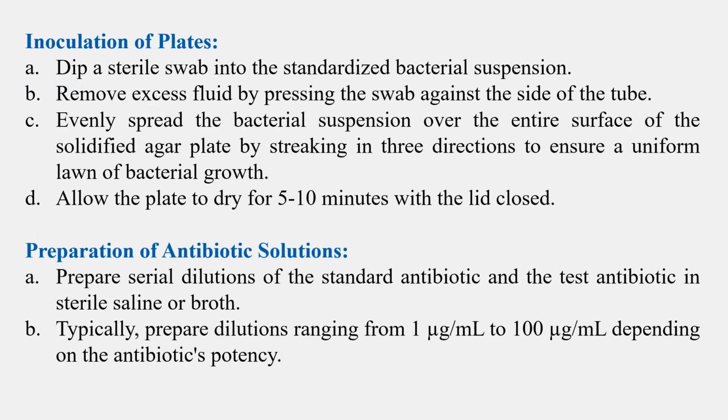Inoculation of plates. Dip a sterile swab into the standardized bacterial suspension. Remove excess fluid by pressing the swab against the side of the tube. Evenly spread the bacterial suspension over the entire surface of the solidified agar plate by streaking in 3 directions to ensure a uniform lawn of bacterial growth. Allow the plate to dry for 5 to 10 minutes with the lid closed.